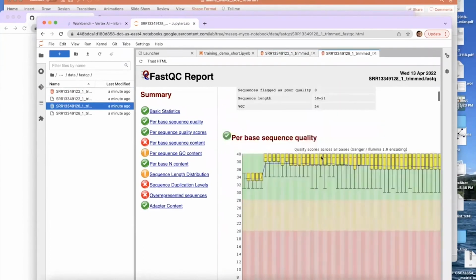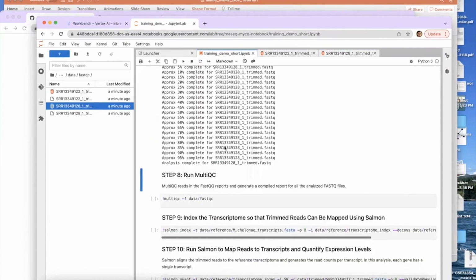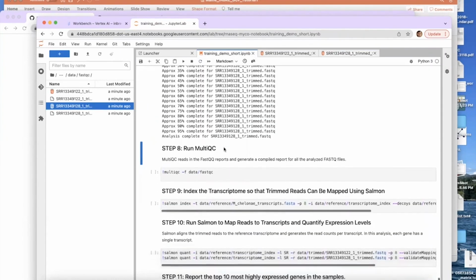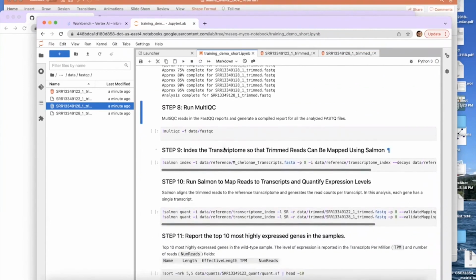There were more than 2 samples in this experiment, but here, in order to make this workflow run very quickly, we're only going to look at 2 samples. And in the full tutorial with the complete data set, again, it's analyzing all the samples with all the reads and doing things as you would normally.